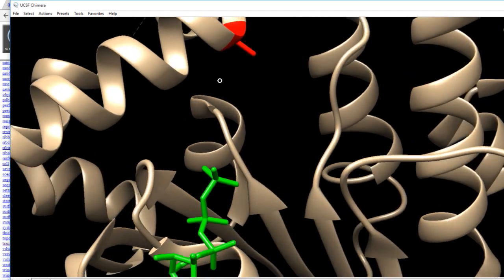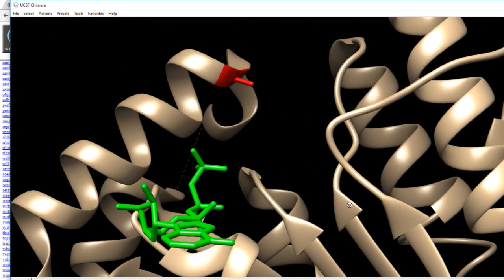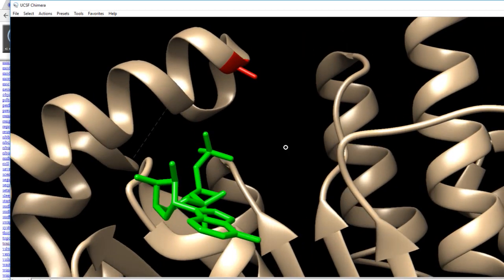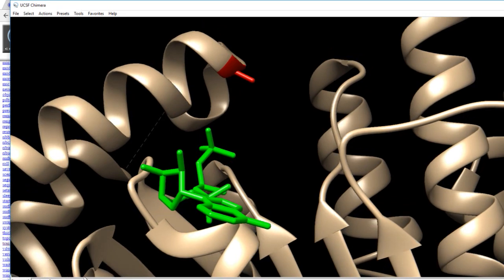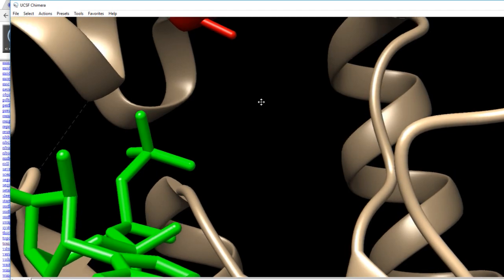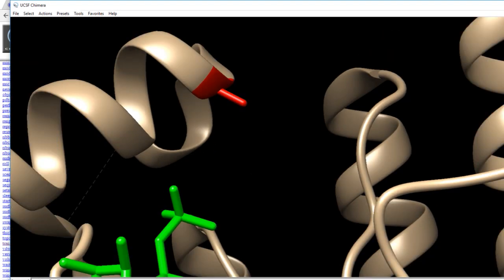Now let's turn that a bit. Oh, I'm getting a bit lost here. Let's get this back to exactly where I want. There we are. And I'm going to zoom in. Oh, drop that down just a little. That's going to be a great view there. And I'll call that pos3. So I'll save pos3 there. You could do whatever you want with positions and so on.